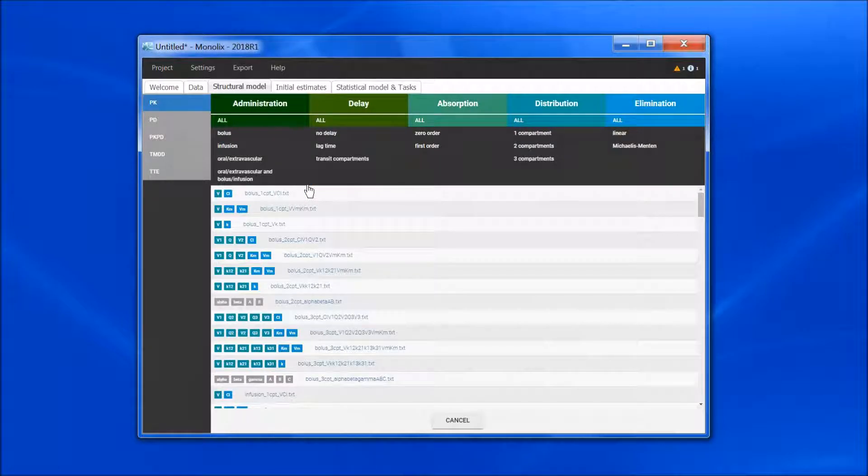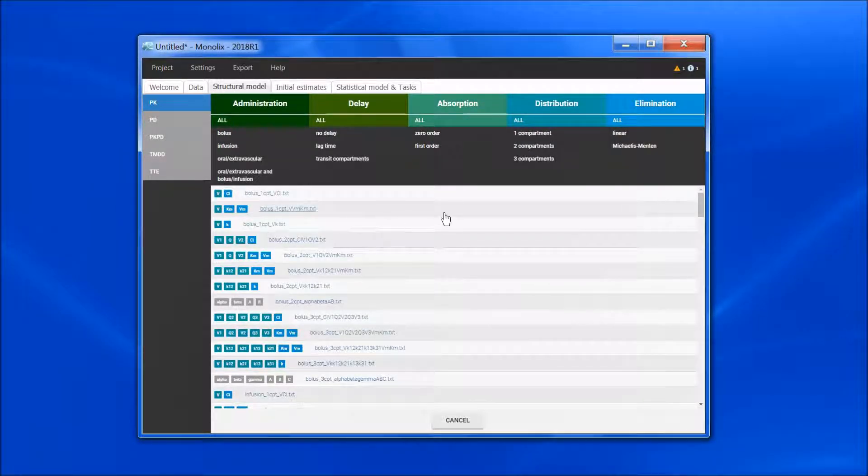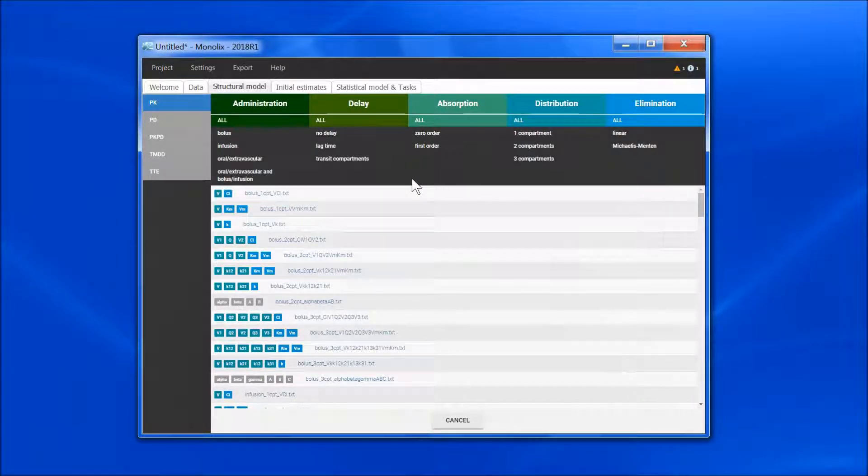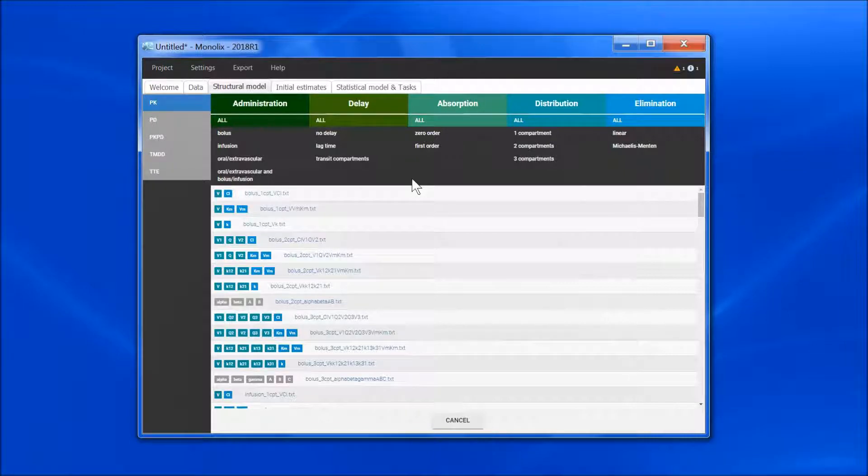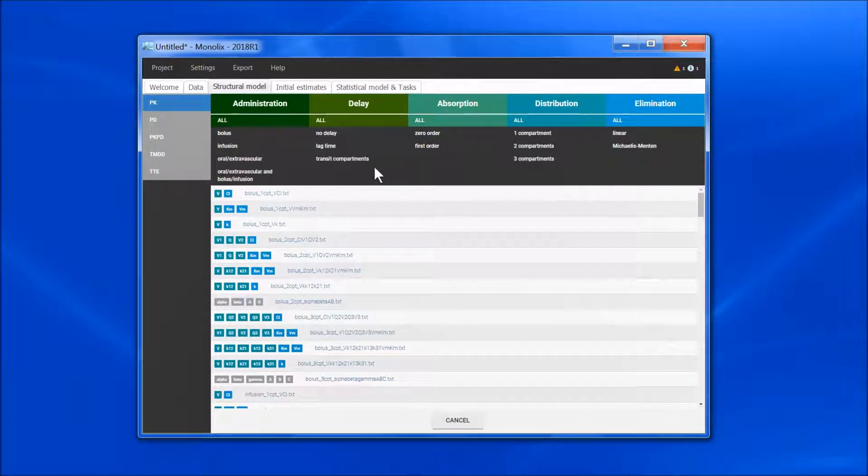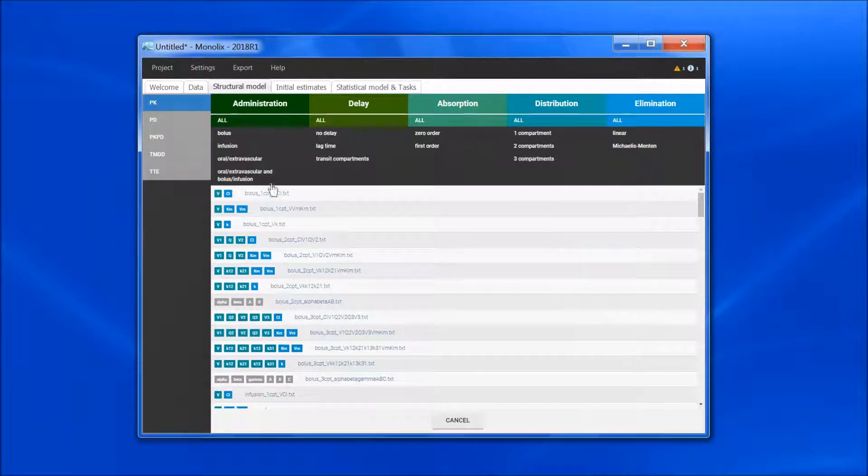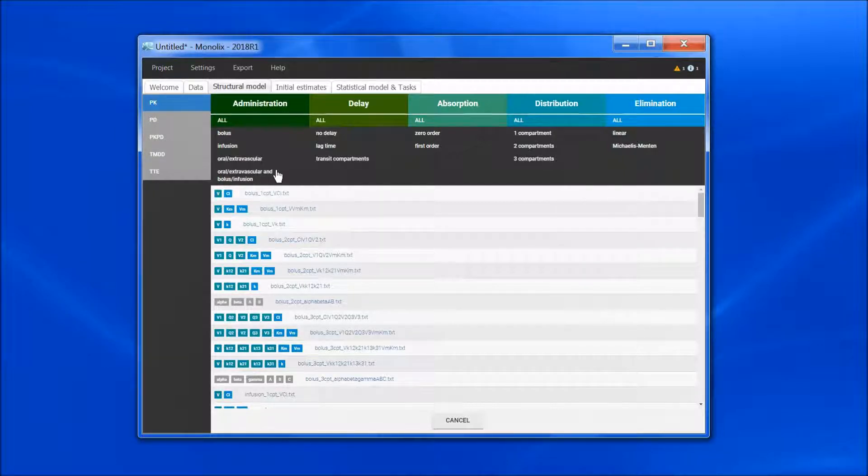In the PK library, we have added two additional options compared to the previous version, the transit compartments to create a smooth delay, and the administration of both extravascular and intravascular doses.